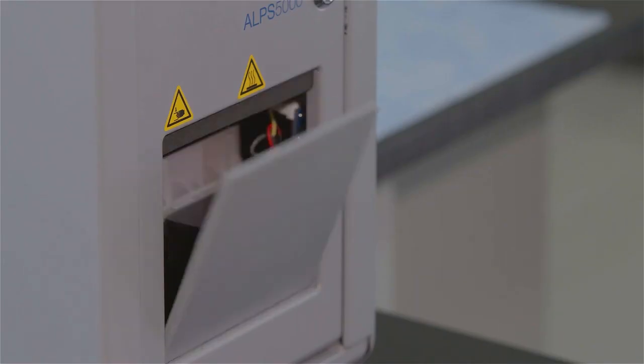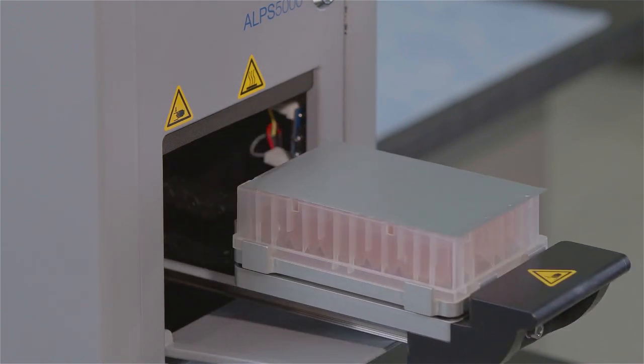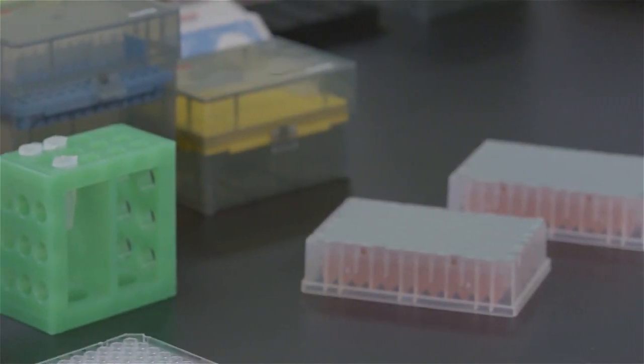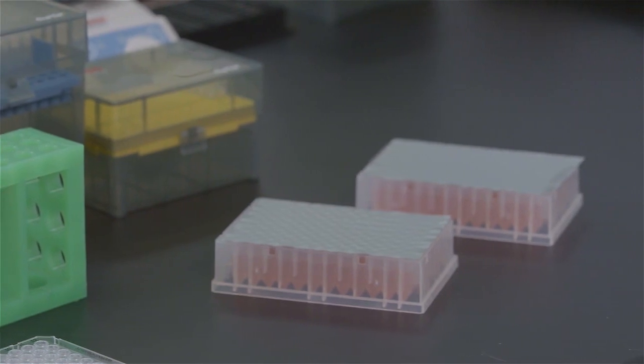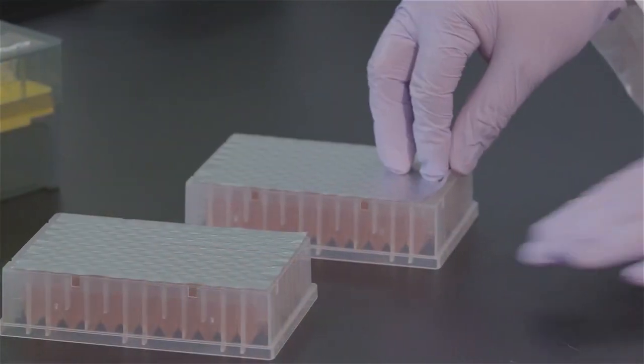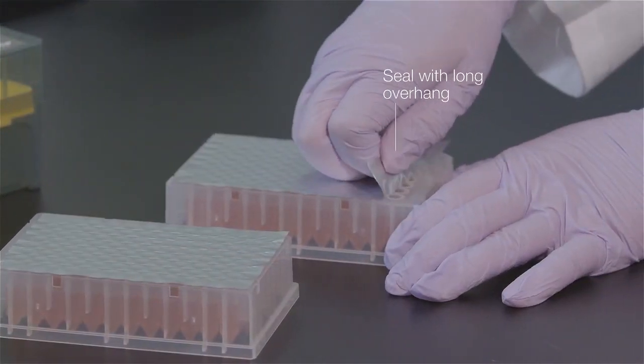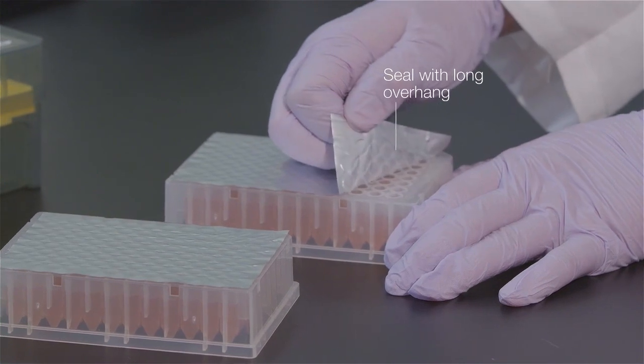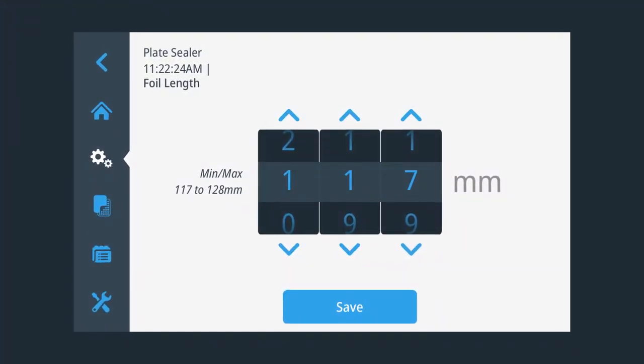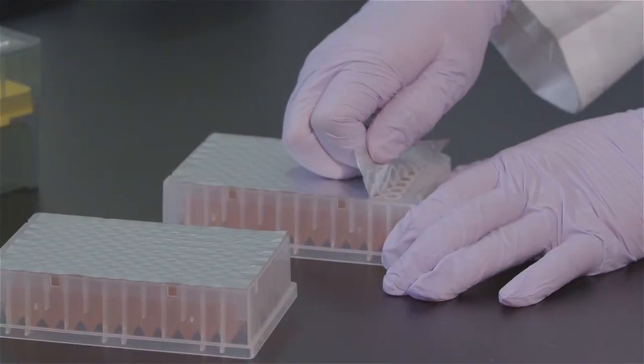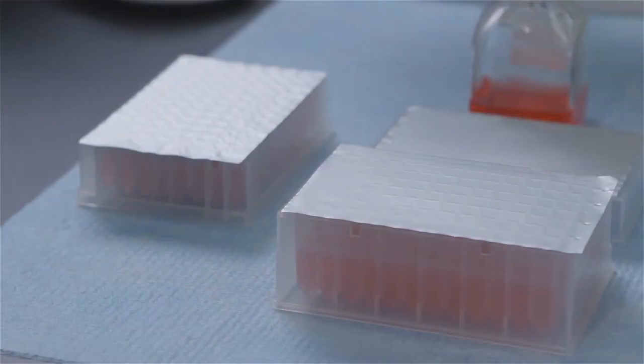You can set the length the ALPS 5000 automated plate sealer will cut the seal to. For example, you can make it longer to create more overhang, making the foil easier to peel off. You can also program the unit to cut the seal with no overhang. This helps to avoid inadvertent peeling and keeps the plate neater for storage.